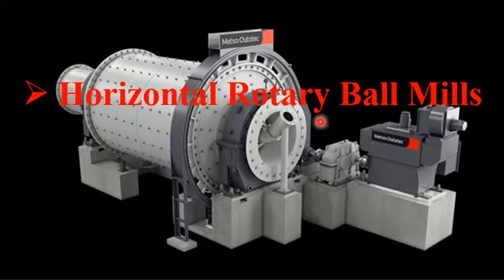Please note that the nature of the balls used in horizontal rotary ball mills will depend on the nature of the material which we want to crush. There are different types of crushing balls used, and some of the common balls used in horizontal ball mills are ceramic balls, flint pebbles, and stainless steel balls.